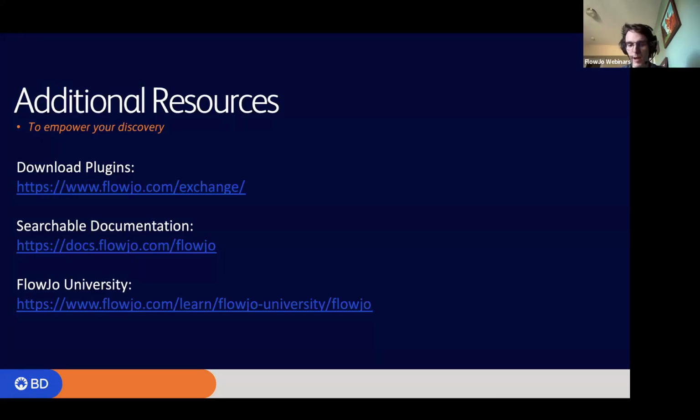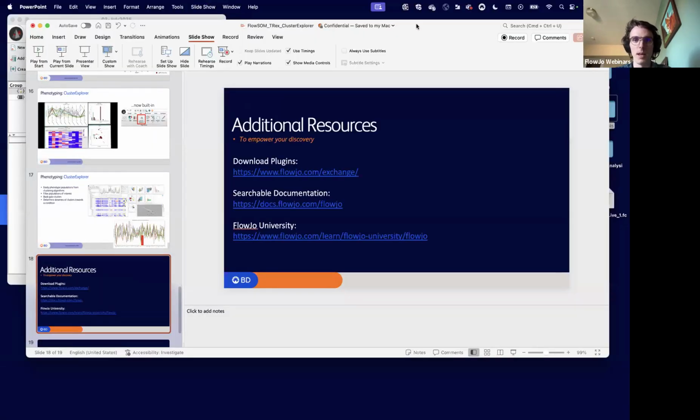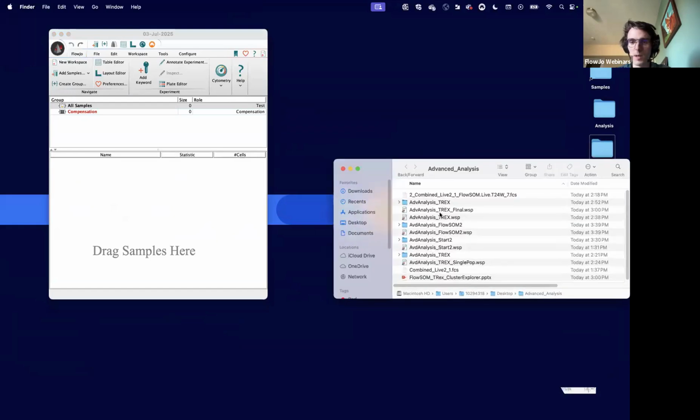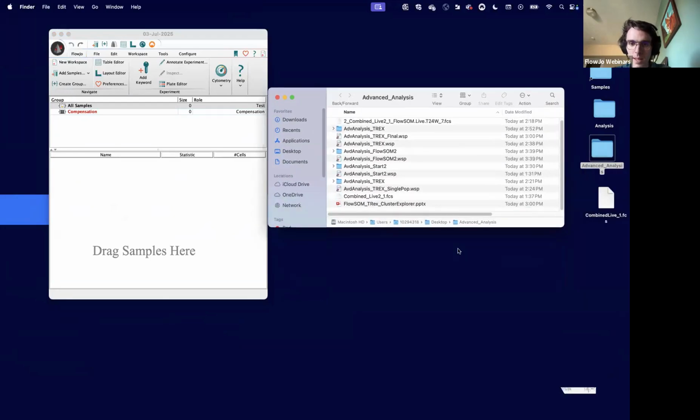But now I'm going to leave the PowerPoint part of my demo, and let's dive into actually doing the analysis. So I guess I don't have it open right now, but let's go ahead and open up this advanced analysis thing here, and let's open up the one that says start, which is this one.